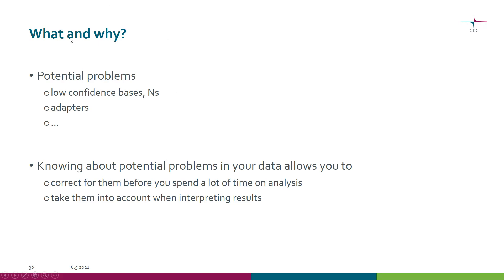So what kind of problems are there and why should we care? When the sequencing machine makes base calls, it's not always 100% confident, and these confidence levels are recorded as base qualities. If the machine is not able to decide what call to make at all, it will just put in N instead of one of the four bases. There can also be adapters and primers left in the reads, which we obviously need to remove prior to analysis.